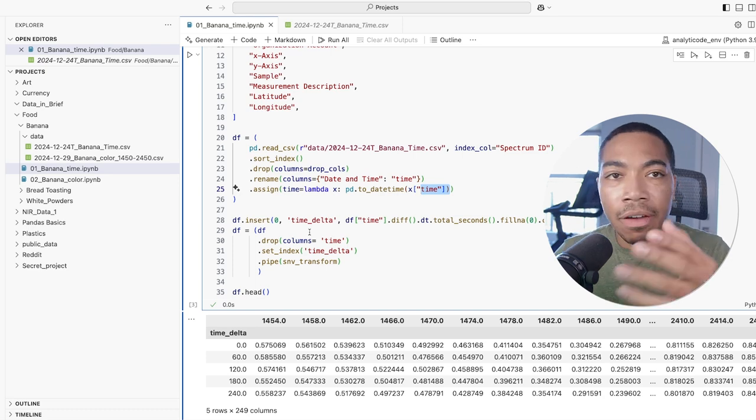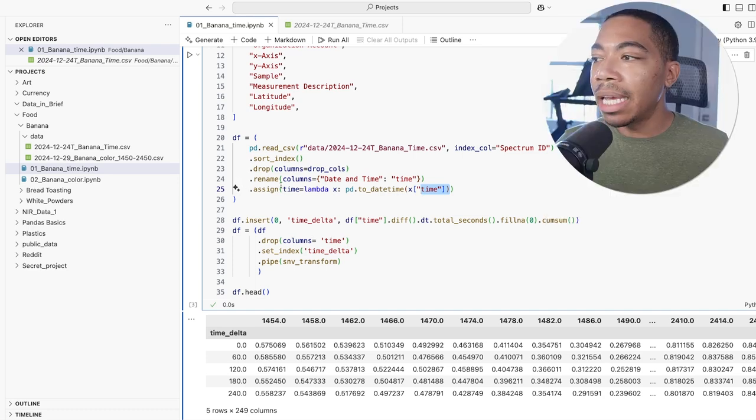But as you see, I have the chained methods here. Again, this is why I really enjoy chaining methods. It's really clear as to what's happening as we go from our original data frame to our final data frame, where I'm previewing the first 5 rows of that table.